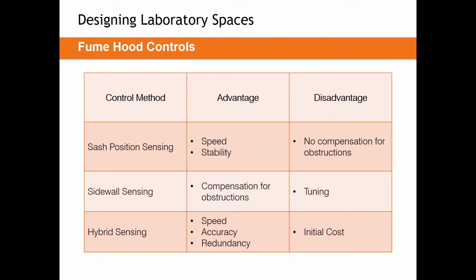The downside is it will need to tune that loop for you. It is a control loop that will take some time to get it right. It can still be done very quickly, but it won't be as quick as sash position sensing.